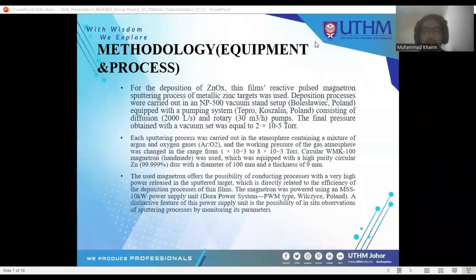Assalamualaikum, my name is Muhammad bin Shafiq. I will present about the methodology, equipment and process for the deposition of zinc oxide thin film. A reactive pulse magnetron sputtering process of a metallic zinc target was used.